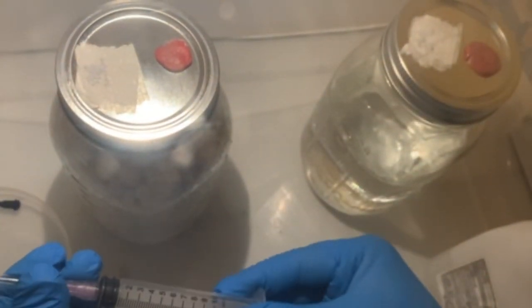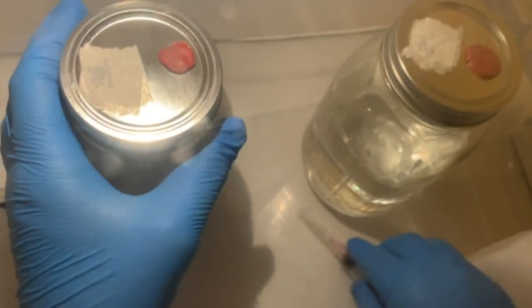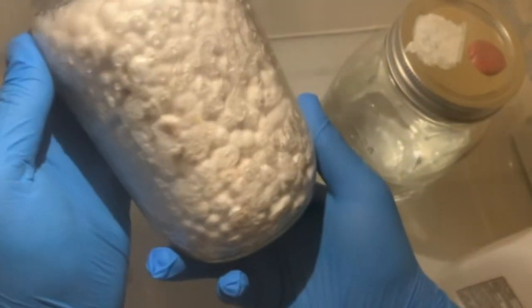Now just inject the sterile water into the grain jar and tilt it back and forth to let the water run over the mycelium.